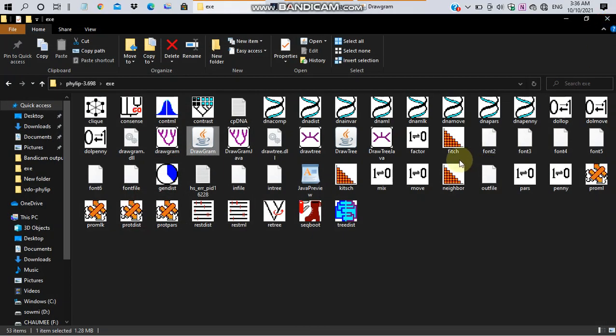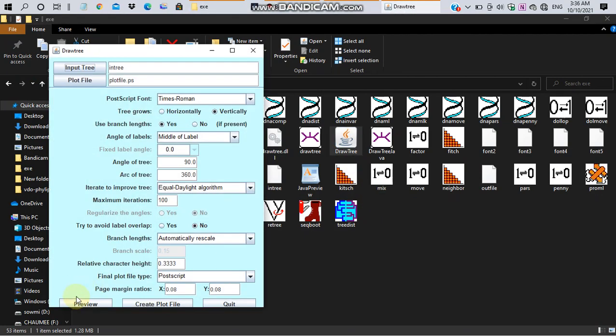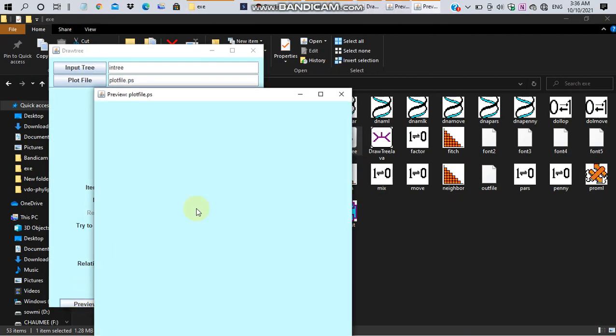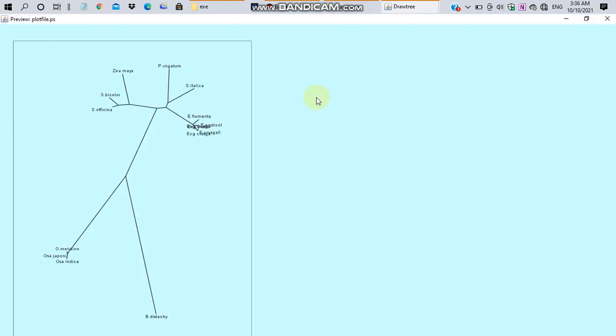We can construct the unrooted tree for the same data. For this, go to DrawTree and click on the preview. You will get this tree. In the unrooted tree, we can't say from which species the terminal nodes are all evolved.